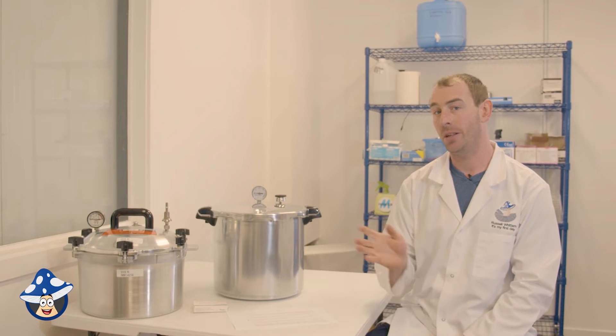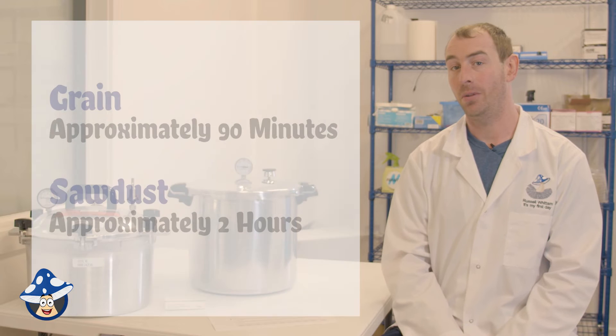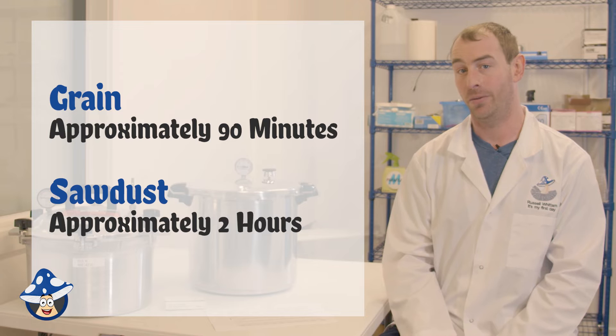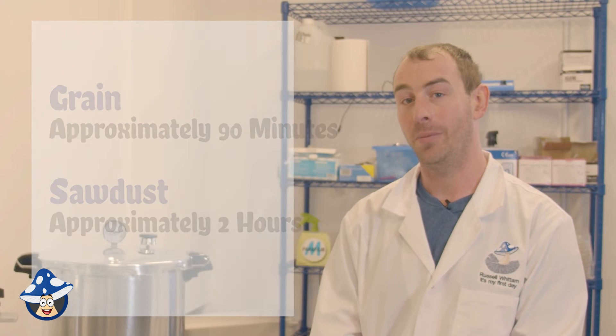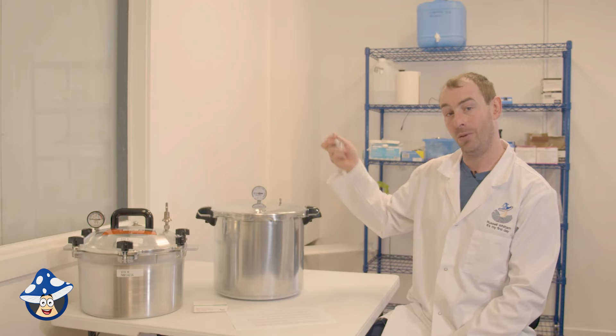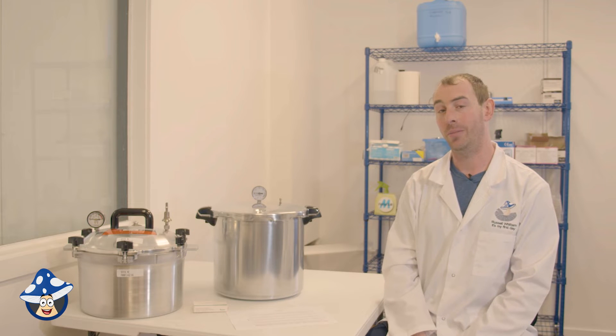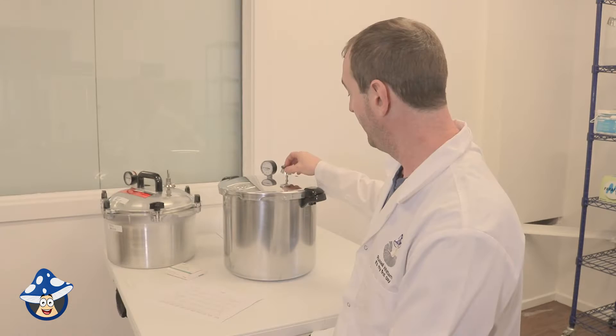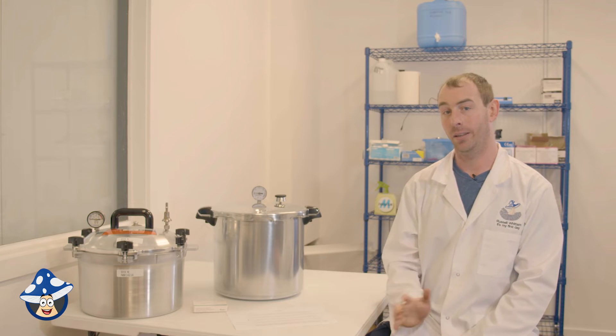When using your sterilizers or pressure canners, make sure you read the manual and have enough water in there for the cook time. Generally, to get your substrate up to temperature you need a minimum of about 90 minutes for grain and about two hours for sawdust substrate. When warming up, have the vent open or the weight off and vent for at least 10 to 15 minutes so all the cold air is purged from your bags and jars before building pressure. Start your sterilization time from when you reach full pressure.